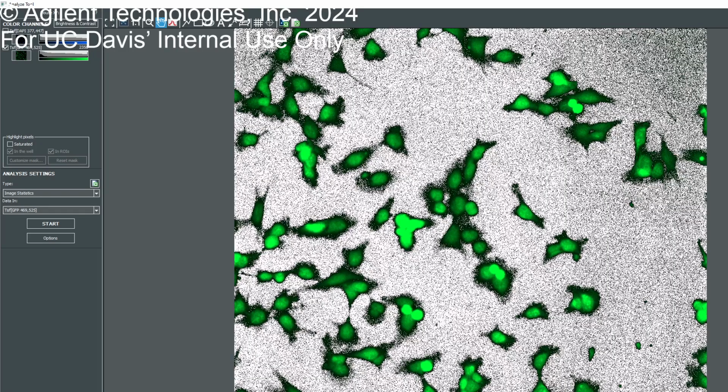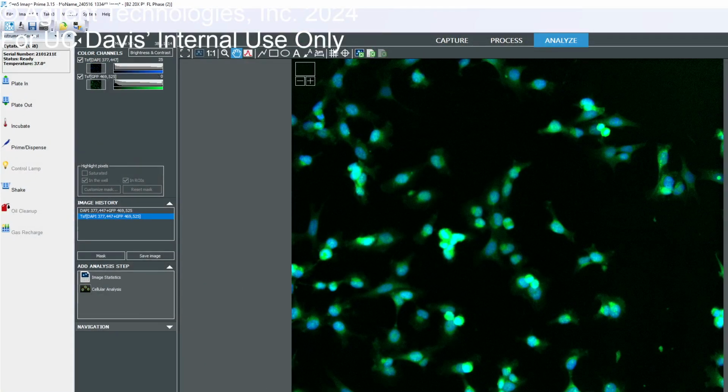All right. And once you are ready with the setup, then you just click on Add Step, which is again on the bottom left, and this is going to add this step to the workflow. So now you can see it on the right. All the readouts are being displayed right there. Any questions about the image statistics or image level results? What did you say about the add step? I didn't get the last part you did.